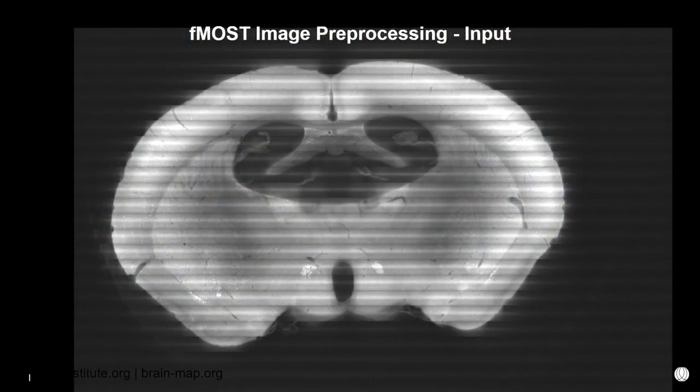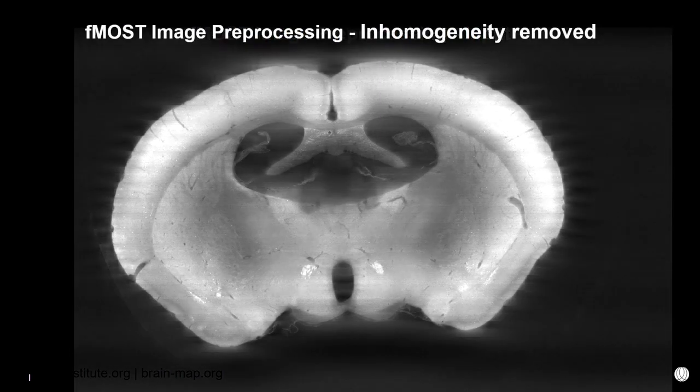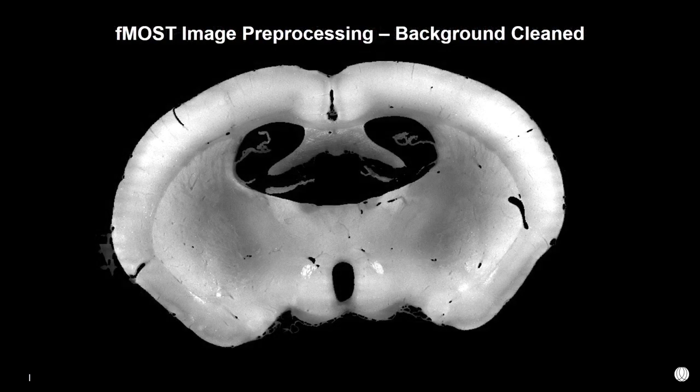So this is one example of the fMOST image we have for registration. The first thing we did in the pre-processing step is, in the frequency domain, we first removed these inhomogeneity stripes, and that gave us a much cleaner image. But as you can see, there is still some other kind of noise here and here. So by using the information from the other channel, we keep making a cleaner image like this.